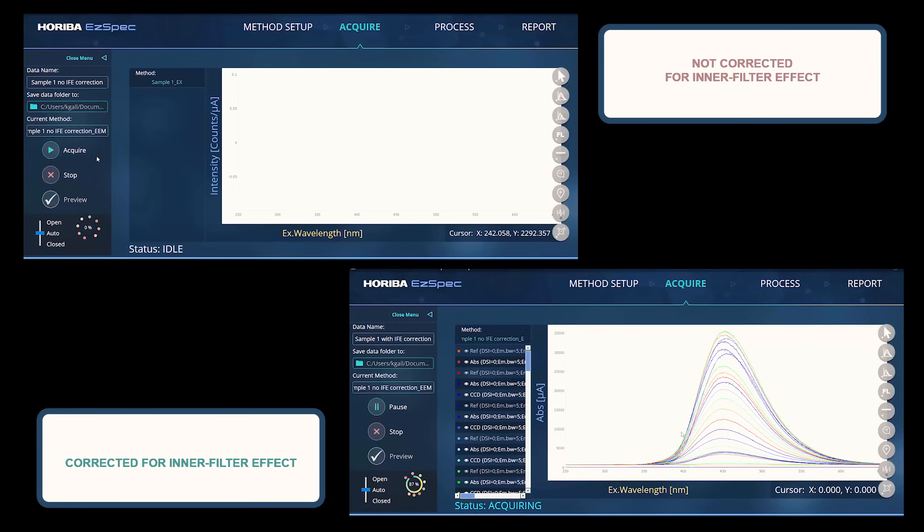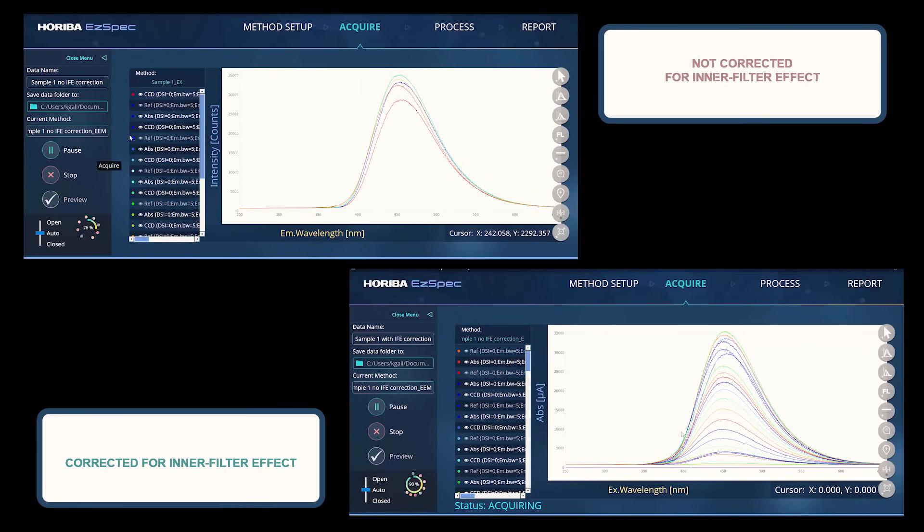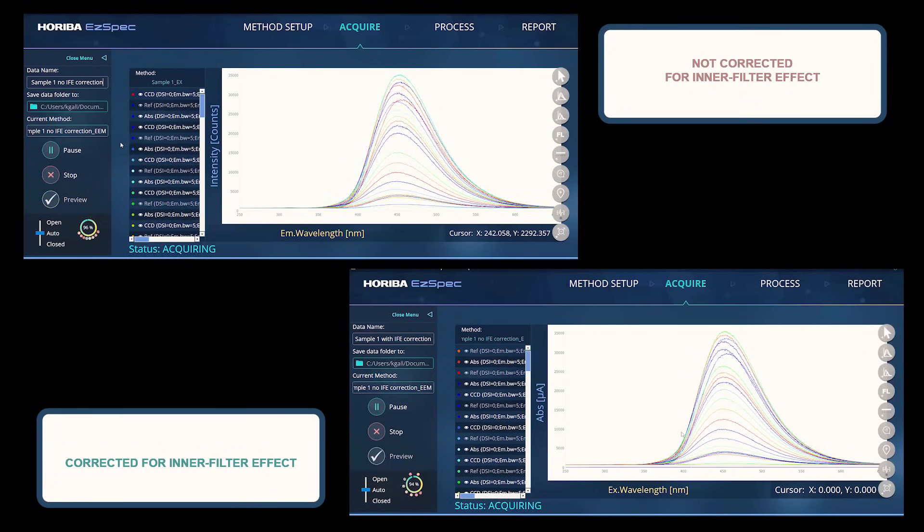Because Duetta is a 2-in-1 instrument and measures absorbance, EasySpec software allows for auto-correction of inner filter effects.